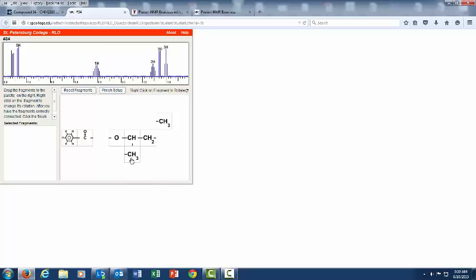Following the directions that I showed you earlier, we are allowed to rotate only CH3 groups, or methyl groups, within the field of the structure. We can rotate the methyl group by right-clicking on it and rotating it either clockwise or counterclockwise so the bonds line up. We're going to rotate this one clockwise and now the bond will line up.